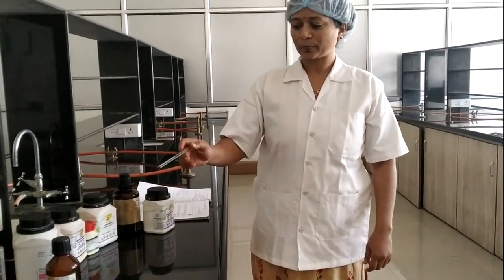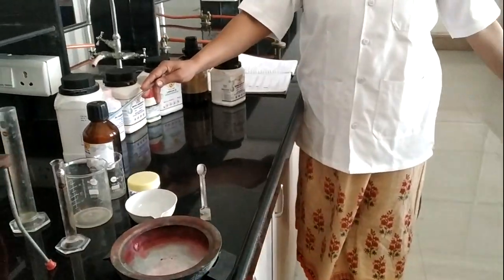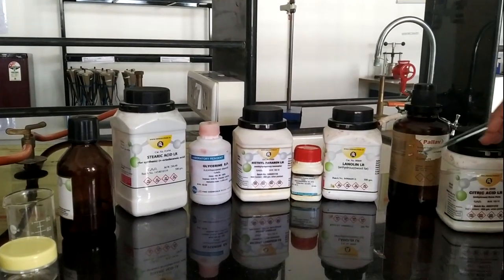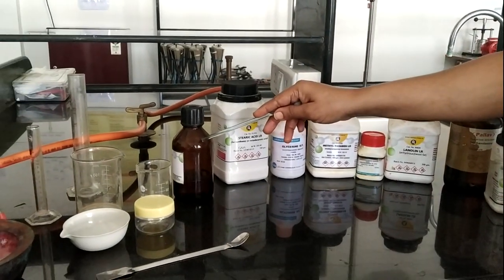These are the stearic acid, glycerin, methyl paraben, propyl paraben, lanolin, triethanolamine, and this is the perfume. Here we use rose oil as a perfume.